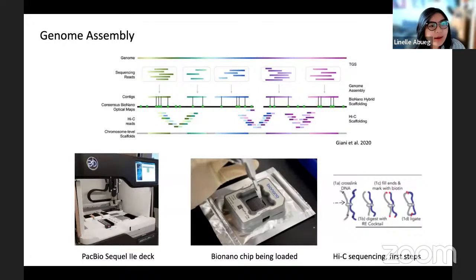Okay, awesome. So I am in charge of a lot of the assemblies and just running them on Galaxy. I've gotten a local Galaxy instance running using our HPC. That's basically my role on the bioinformatics team. Giulio and a lot of the senior colleagues have developed the pipeline and wrangled together the tools to create high quality assemblies. I came onto the project just to get a lot of our backlog done, get these assemblies out and available for public use. So the first part of this talk is going to be going over the pipeline and how it's implemented in Galaxy. And the second part is going to highlight the speckled mousebird and Boyle's beaked blind snake assemblies, which I ran using the Galaxy interface and workflows. Those are two AfricaBP species.